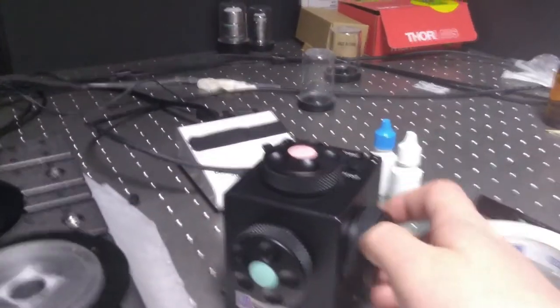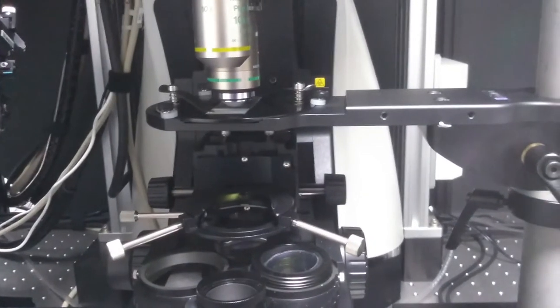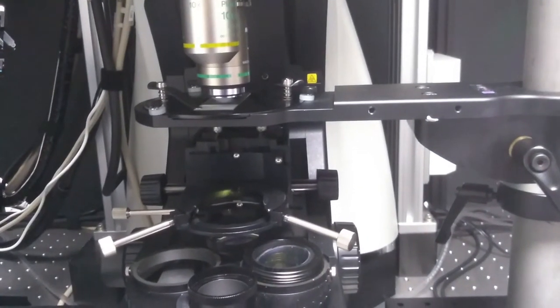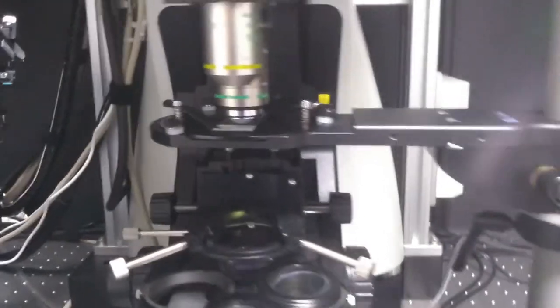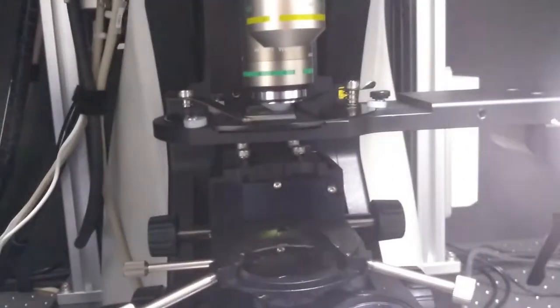You can use the stage control to move your sample about and position it if you need to move it further before trying to focus on your sample.